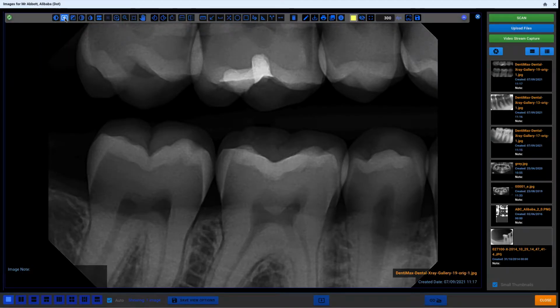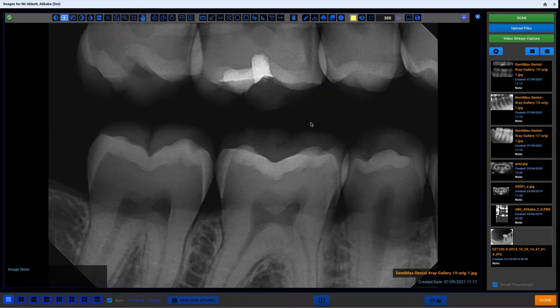The next one is the WWWC Region tool. It applies automatic level adjustments to the image based on a selected area's color range. To use it, select an area on the image using your mouse. For that, click and hold the left mouse button and draw a rectangular area on your image. Release the button when you achieve the required area. The calculated levels are then applied to the whole image. I will reset the adjustments to the original.